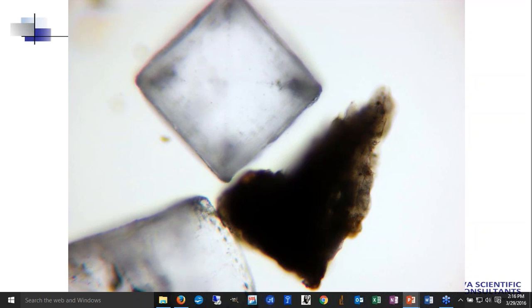So, a typical everyday substance that we use day in and day out, magnified, no scale bars, I don't want to give that away. By looking through a polarized light microscope, with a single polarizer, bright field, we have a squarish particle, and next to it we have a dark particle. If you look carefully at the dark particle, you can see my cursor, it looks like we have some cellular structure here. So one question is, how typical are these particles of the whole?